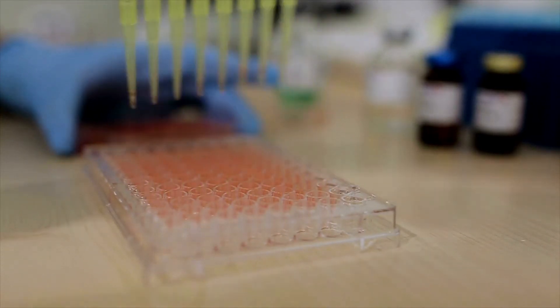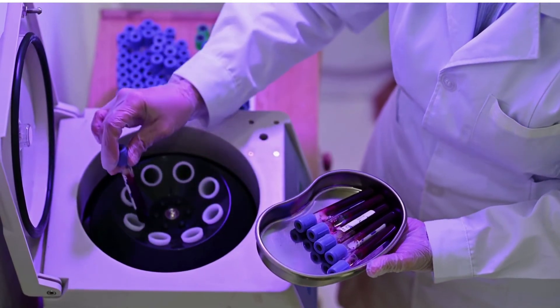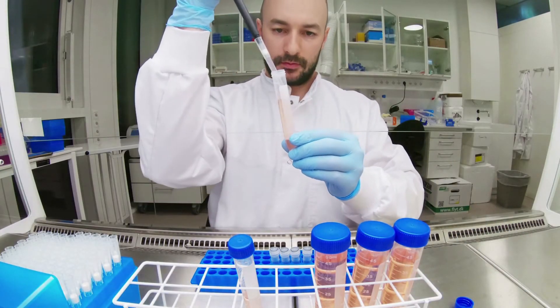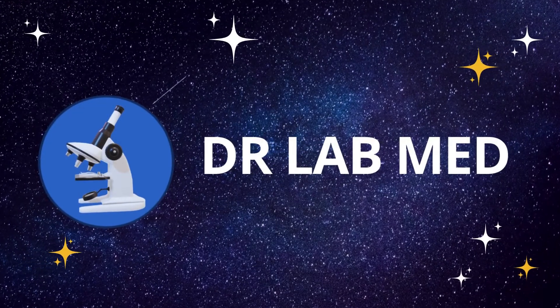Hello guys, how many times have you encountered problems while doing ELISA? Here in this video, I will be covering various troubleshooting tips which will help you in doing quality process in ELISA. So let's get started!